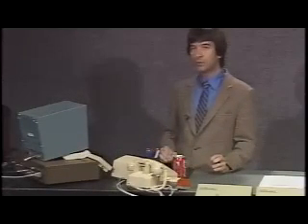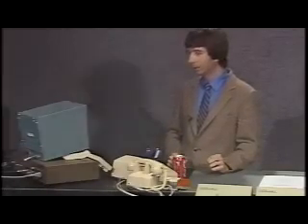Can I have that third section of the videotape, the one that says field desorption? What I'd like to show you is what actually happens as we raise the voltage now, and what you'll see is what happens as we DC field evaporate. We just raised the voltage, same conditions we had before when gas was present. We have some background noise.